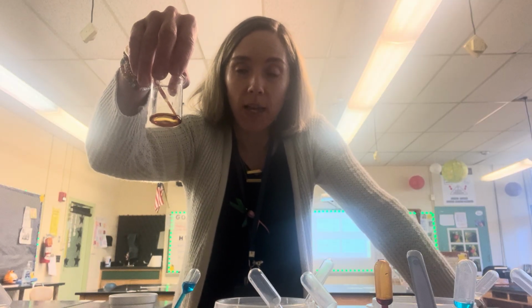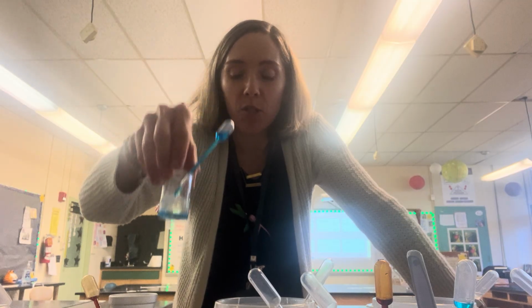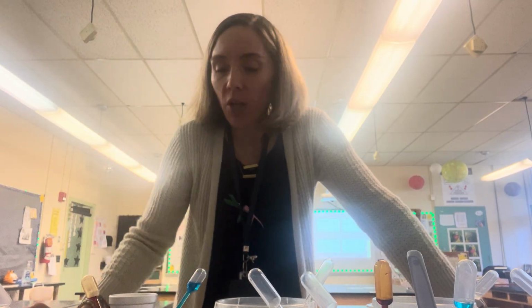Just like in our first lab, the dialysis tubing lab, we used 2 indicators. We used iodine to look for starch. It's brown on its own, turns black when it is exposed to starch. And Benedict solution, it's blue on its own and it turns orange when exposed to glucose, but only at high temperatures. So what we did is we took our samples.